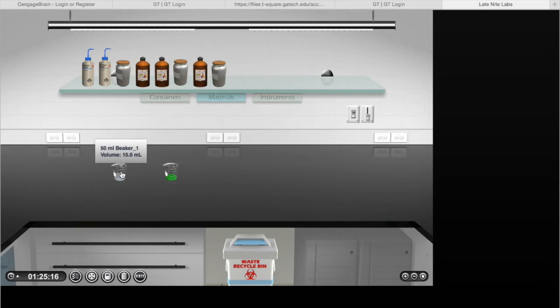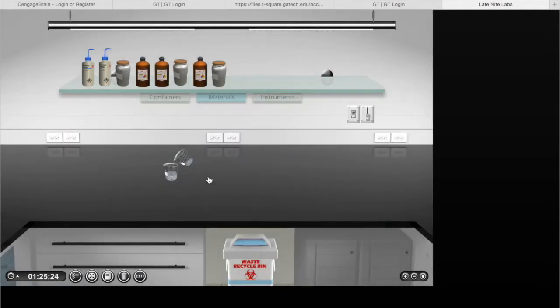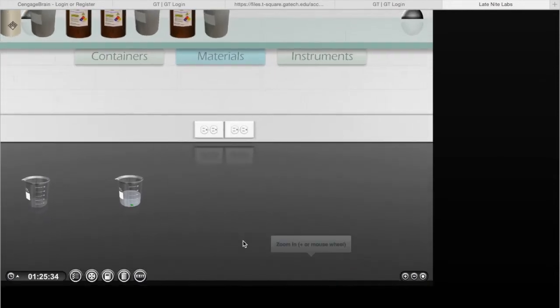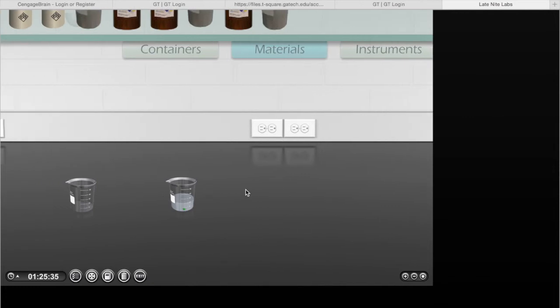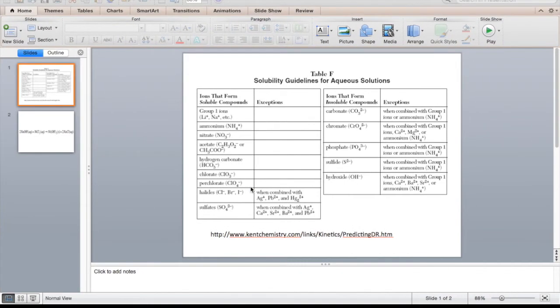After observing the reactants before the reaction, the contents of the 50 milliliter beaker containing sodium hydroxide are completely emptied into the 50 milliliter beaker containing nickel(II) chloride. The reaction of sodium hydroxide and nickel(II) chloride forms a precipitate in a clear solution. The clear solution contains dissolved sodium chloride. The precipitate is observed to be green, and the precipitate of the reaction is nickel(II) hydroxide.